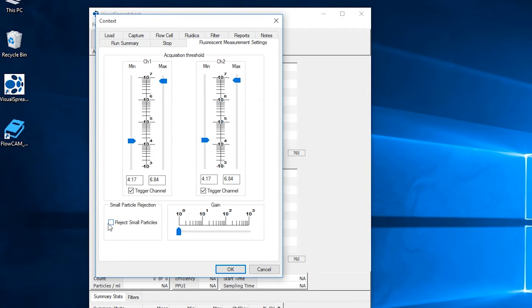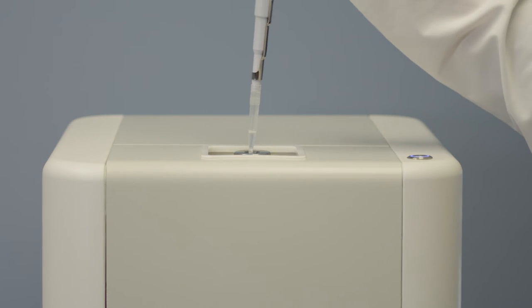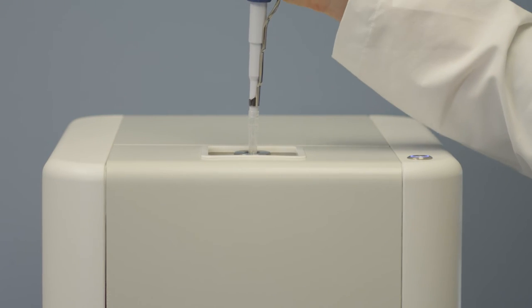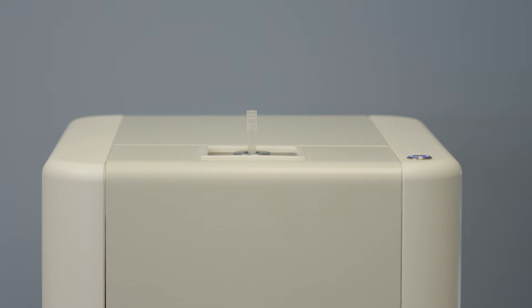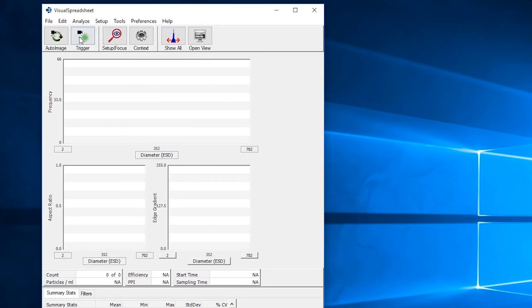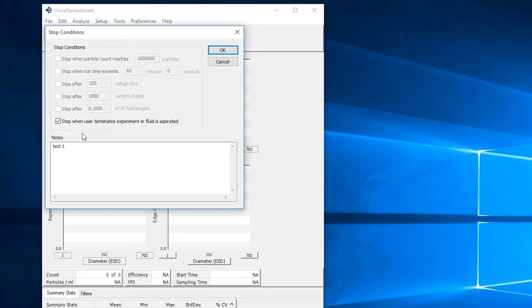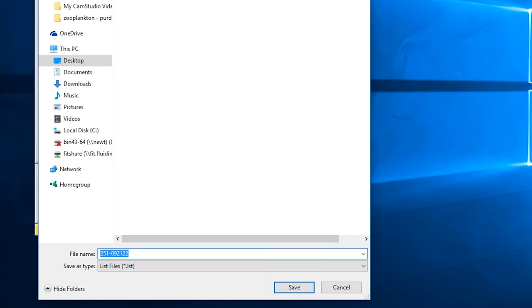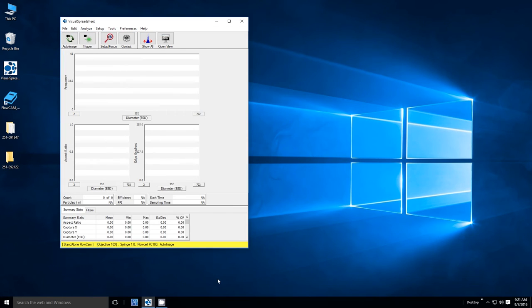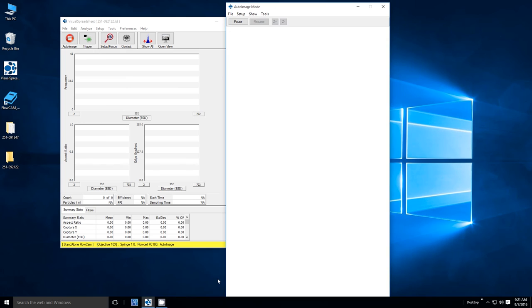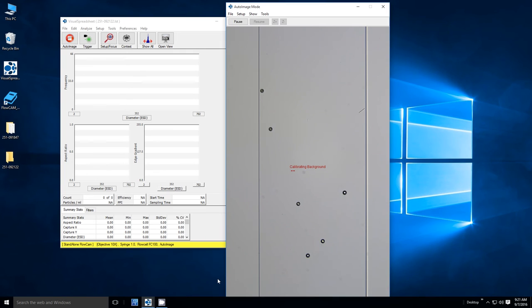Once you have your context settings in place, pipette and insert the appropriate sample volume into the system, detaching and leaving the pipette tip in the sample introduction port as previously done during focusing. Once the sample has been inserted, click on the auto image option in Visual Spreadsheet. Once you verify your stop conditions and add any applicable notes, click OK and save the sample, naming it and placing it into the appropriate directory within Windows. The camera window will then open and the calibration of the background will begin after the system primes a sample down into the flow cell.